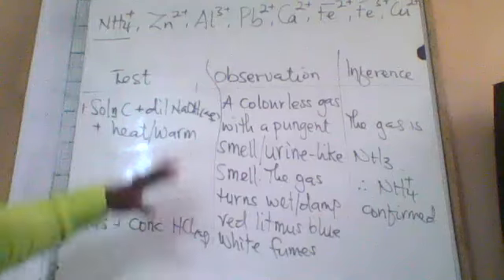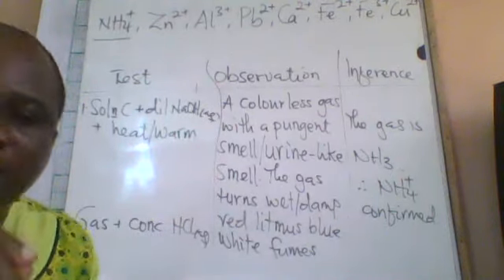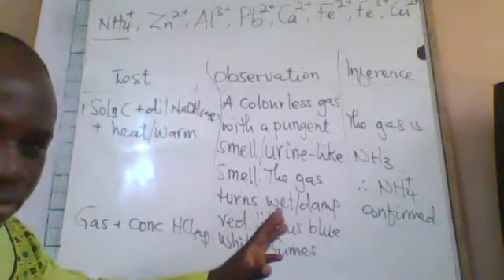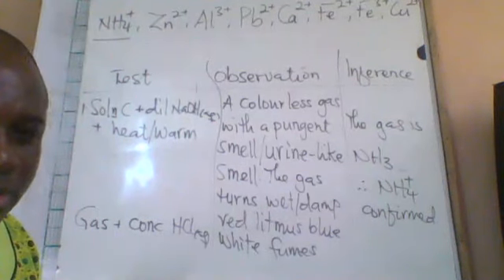All right. So this is the entire test on ammonium ion. And please, what we are doing here is not magic. It is a chemical reaction that is occurring.